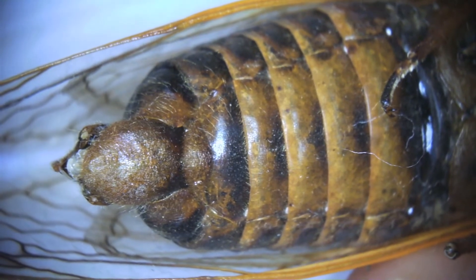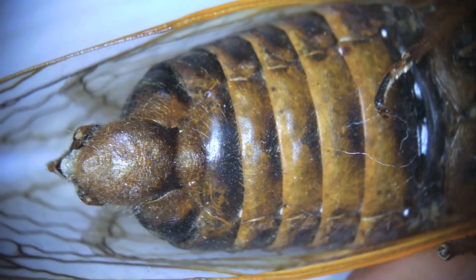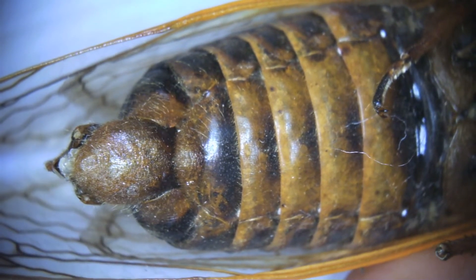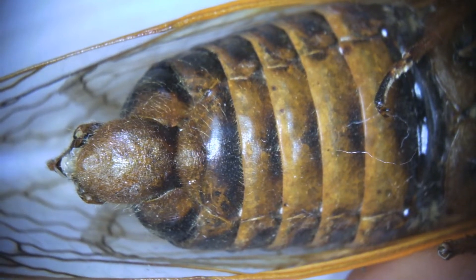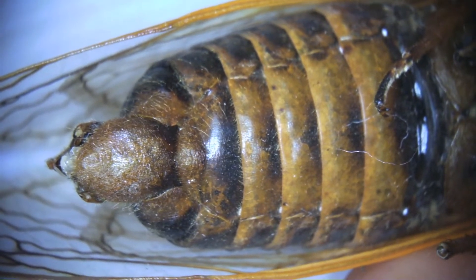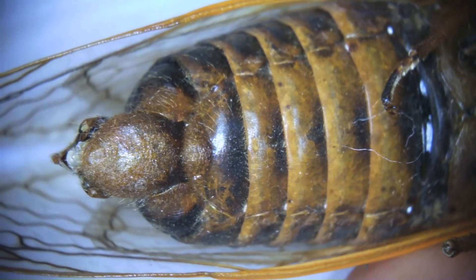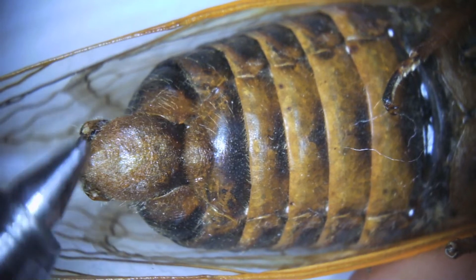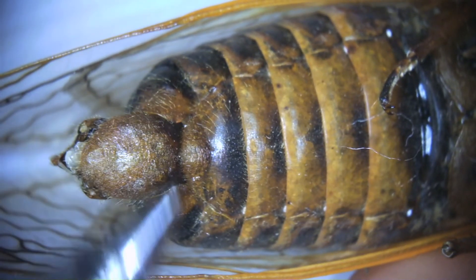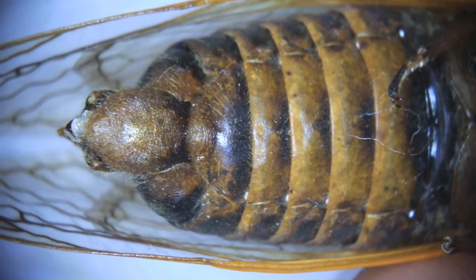A lack of an ovipositor — and you can see this end nubbin here shows that it was a male instead of a female. A female would have had another kind of like a syringe or an injector coming out as well, and they are less spherical; there's more of an indent in a female's end. You can see the male is nice and kind of curved here.